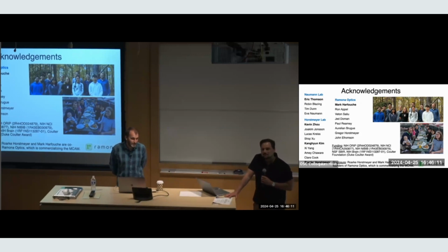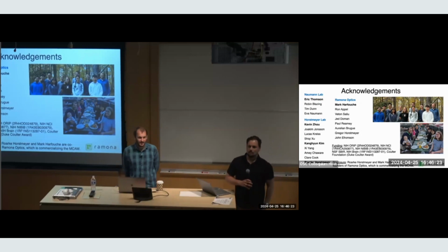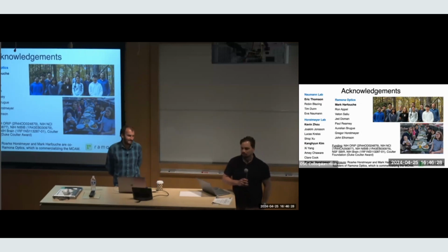The images you showed of those little test blocks with the stereo microscopy, the range resolution is going to be dependent on the object structure and texture, right? So really, you're getting range just from the edges there. It seems like you'd get much better if you had more texture, which you could give the structure. Great point. That's why I'm a little hesitant to claim some sort of resolution in that regime, because it is very much object dependent. But if you resort to something that you're controlling, then absolutely. You probably don't have to project a pattern; you can even do some LED array stuff.